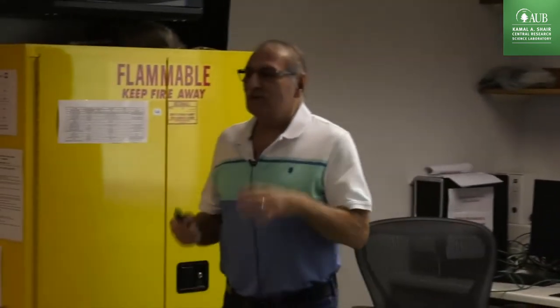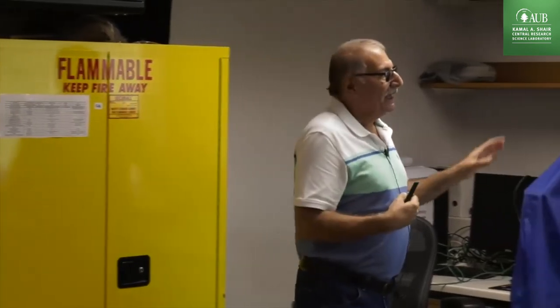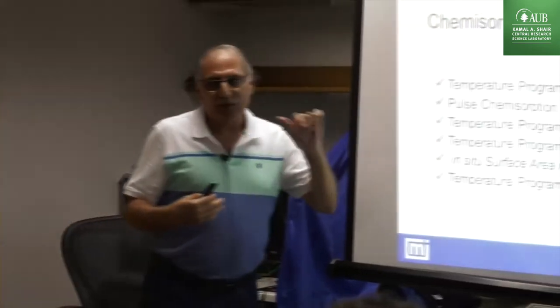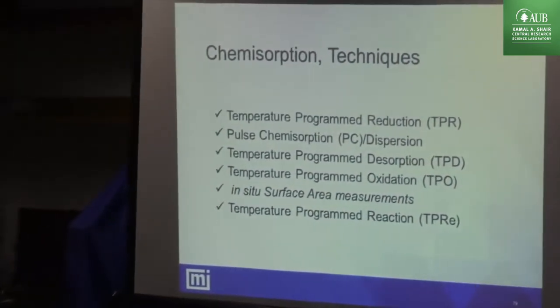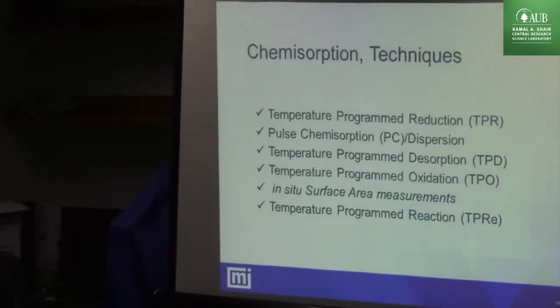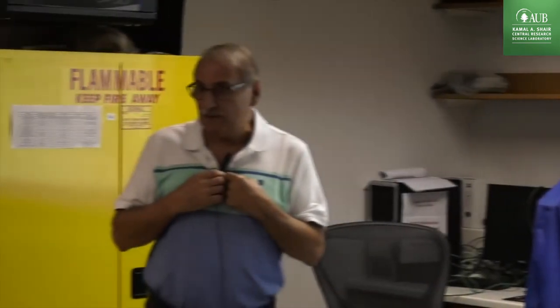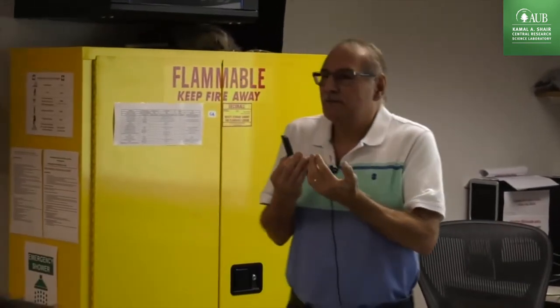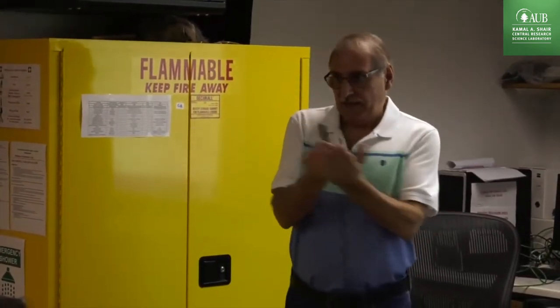We need to combine the volumetric technique with the flowing technique. The flowing technique is this TPR, temperature programmed reduction. Yes, you can. If they adsorb CO or hydrogen, you can apply these techniques. The only condition is that your sample has to adsorb CO, has to be fixed first, okay? It will not change during the reaction, and adsorb CO, huh?